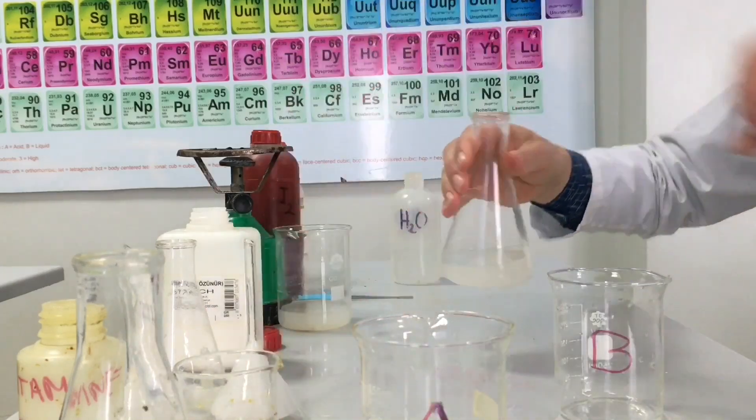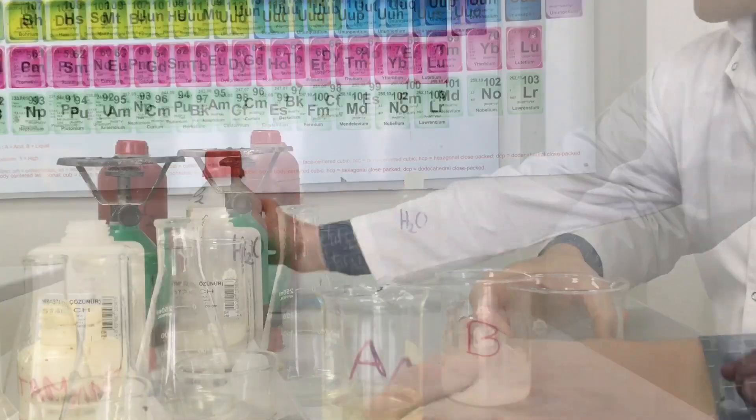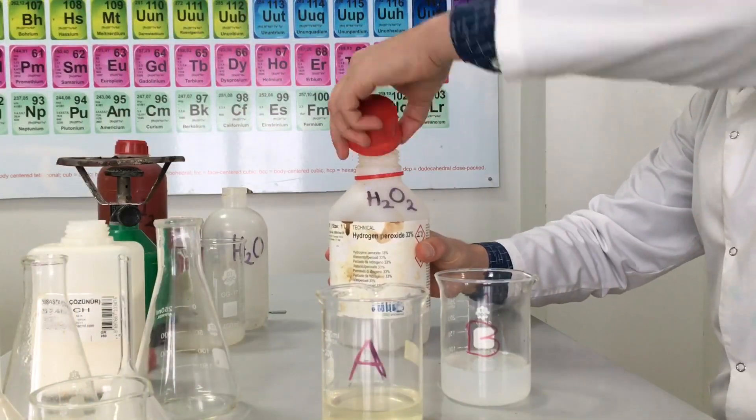Solution B is prepared by adding starch solution and some quantity of 3% hydrogen peroxide.